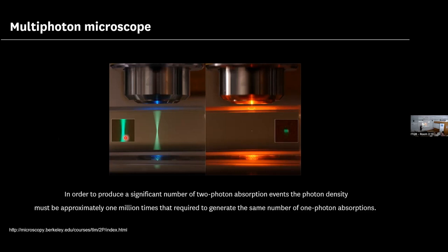So it's going to be a pulse laser that sends a bunch of photons. The objective will, as in a confocal microscope, focus them on a single point. And only at this point do we have a density of photons high enough that we have this rare phenomenon of multiphoton excitation happening. You don't have excitation happening above or below because you don't have a high enough number of photons. They are further apart. They're still being focused, it's just not possible to happen. It's very, very, very unlikely.